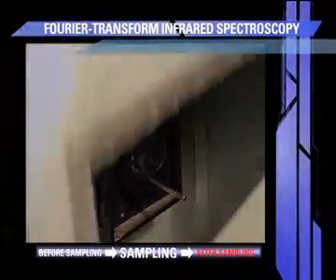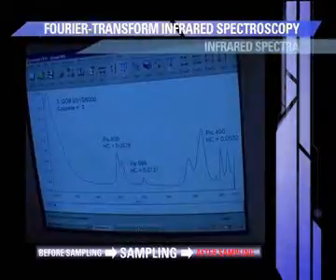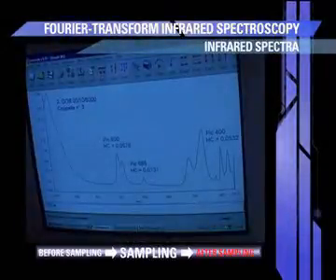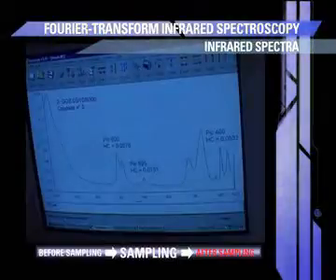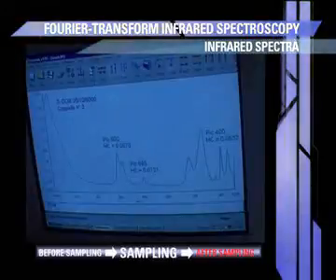The spectra of analysis by infrared obtained for the sample make it possible to determine the mass of crystalline silica. By relating this mass to the volume of air sampled, one can express the concentration of crystalline silica in the air.